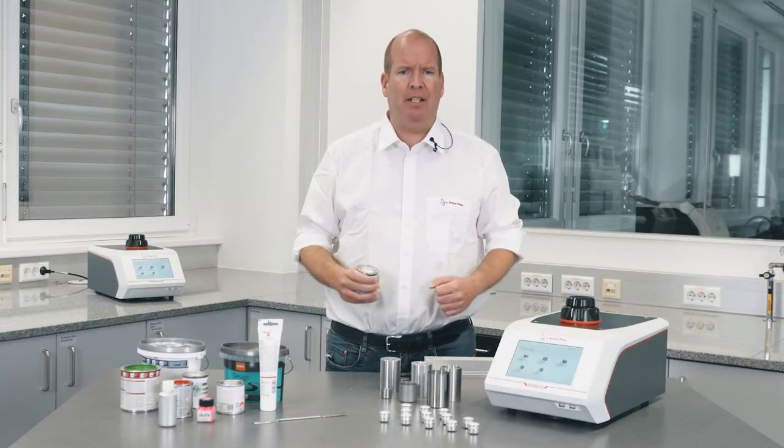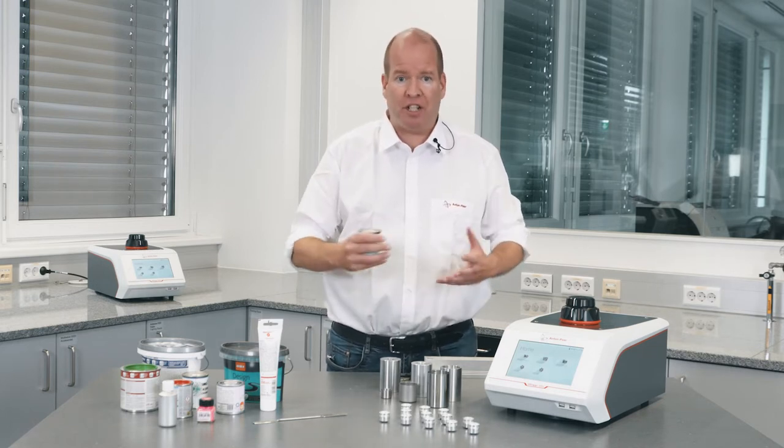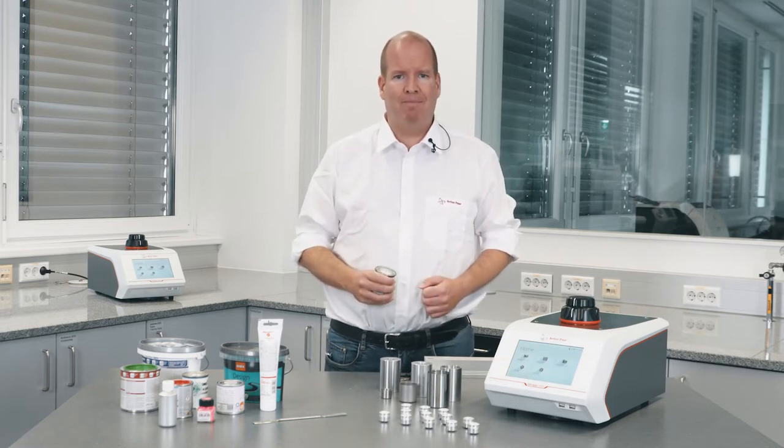The density of paint is extremely important for manufacturing control to ensure desirable application behavior and consistent finish quality. It can affect the pour behavior of the paint and the paint film when it dries.